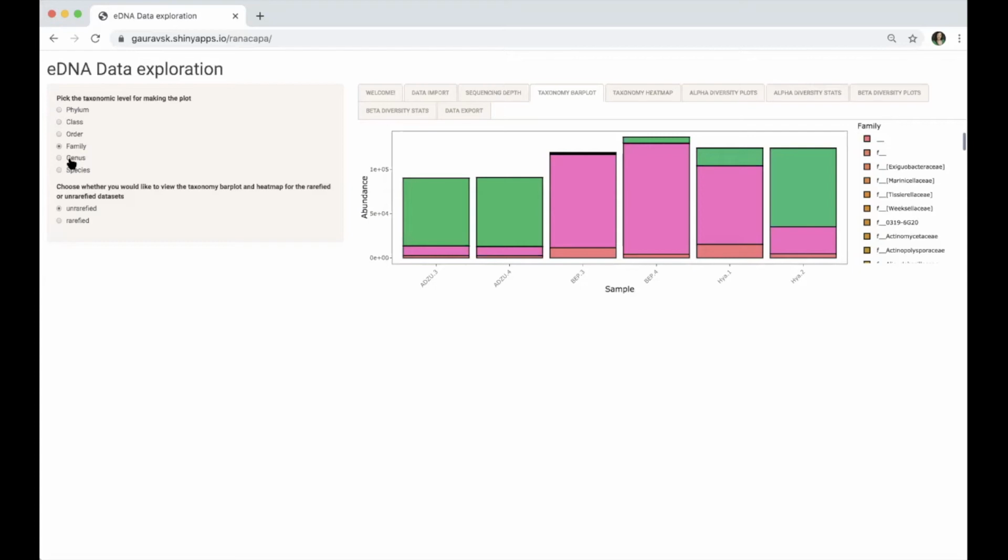We can do phylum, class, order, family, and then we won't go any further. So if we look at the family level, and you can do this for your data set as well, you can then compare the different samples and basically the types of bacteria that are found in each sample. And you can make some comparisons about your samples.